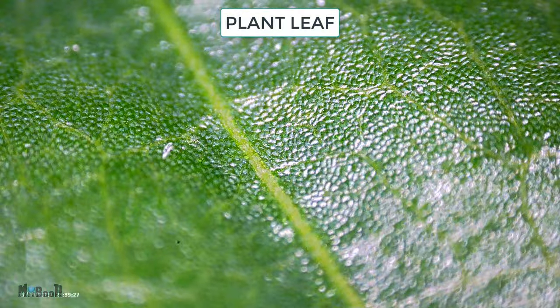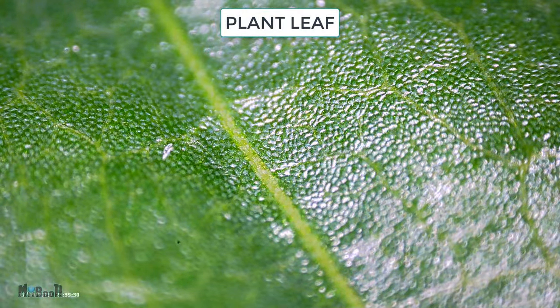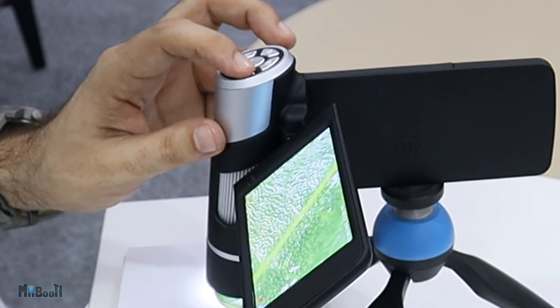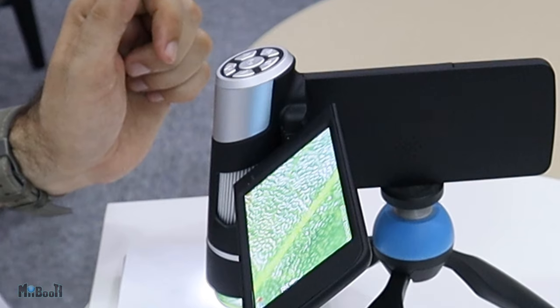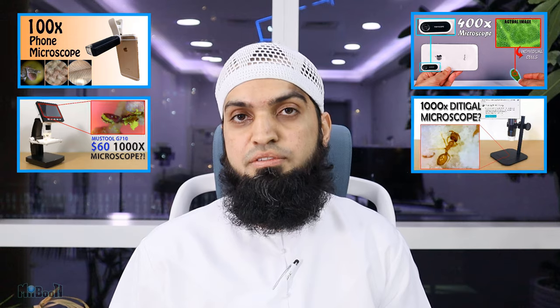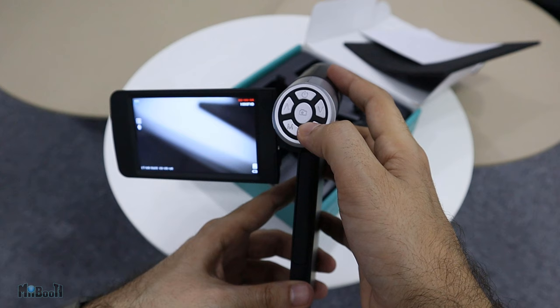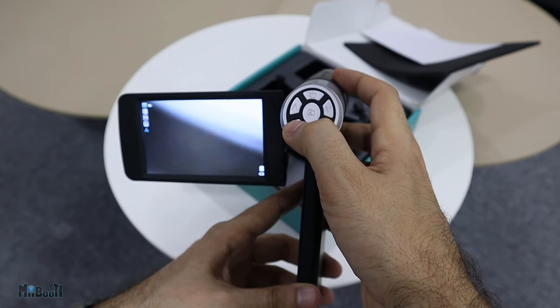As per the specs, it does a maximum optical magnification of 28x, and additionally you can press the arrow keys to add another extra 3x digital zoom, which technically takes it to 84 times magnification. Frankly speaking, 28x is quite a modest number — usually scam products boast numbers like 1000x or 2000x. Andonstar is saying this is 28x, and this 28x is way better than the 100x, 200x, 400x products I've tested before. Anyways, you can take pictures with the camera button or click the M button to switch to video mode and then press it once again to play back your recorded videos and pictures.